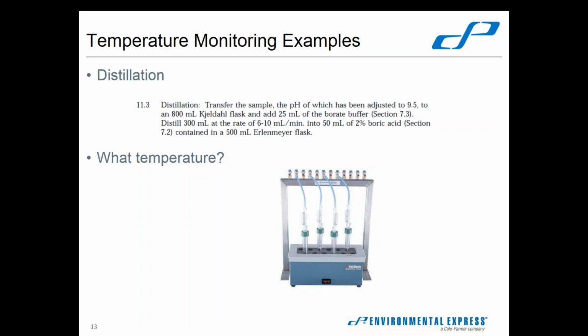Physics doesn't allow a liquid to be at a higher temperature than its boiling point. I may have that written down at some other point in the presentation here. But if you have pure water, it cannot get higher than 100 degrees Celsius, because all of the heat energy that would normally raise the temperature is now going into vaporizing the water and going through a state change.